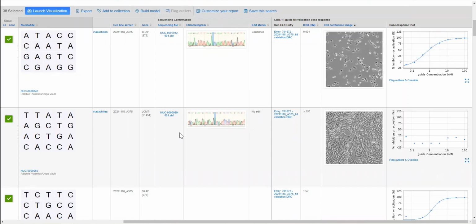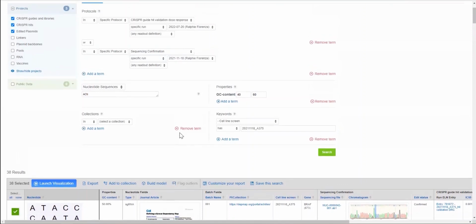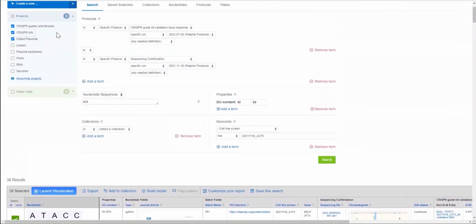This report was generated utilizing an easy-to-use multi-parameter search query that you can find up here at the top. The first component of the search query is selecting a project. Projects are the core collaborative unit of CDD Vault, and this is because every user, piece of data, and registered entity lives in at least one project. Our customers commonly use projects to separate their data based on internal pipeline programs, or even to give CROs limited access to their internal data.